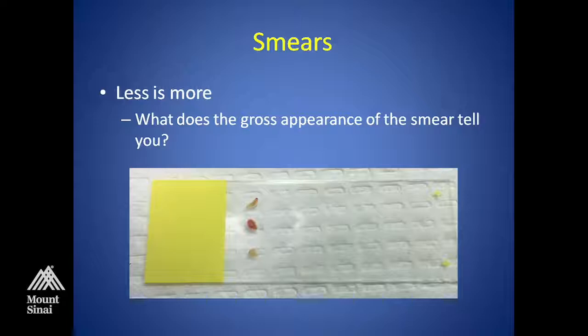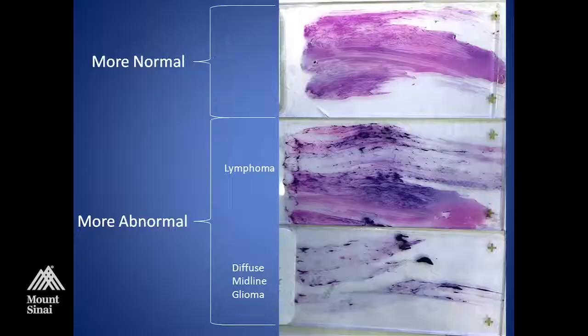When you get the specimen, it's important to evaluate what kind of tissue you actually are getting. Is it firm tissue? Is it soft brain tissue? Ideally, if it's tissue that is heterogeneous as far as its discoloration — if there's white matter and cortex — I'll take pinhead-sized pieces of the tissue from various regions, put them on the end of the slide as shown here, and make a smear.